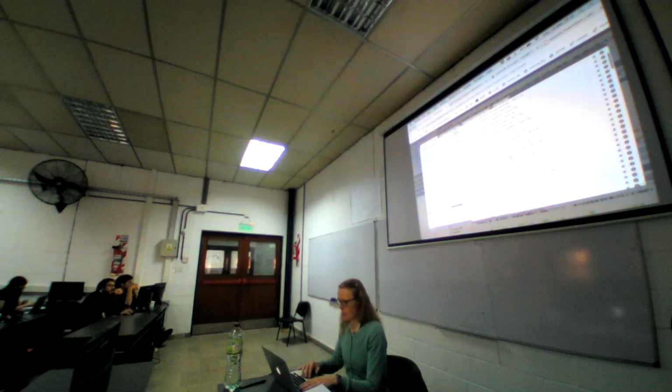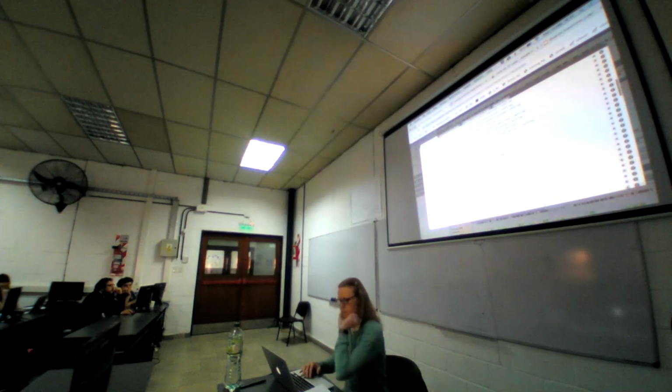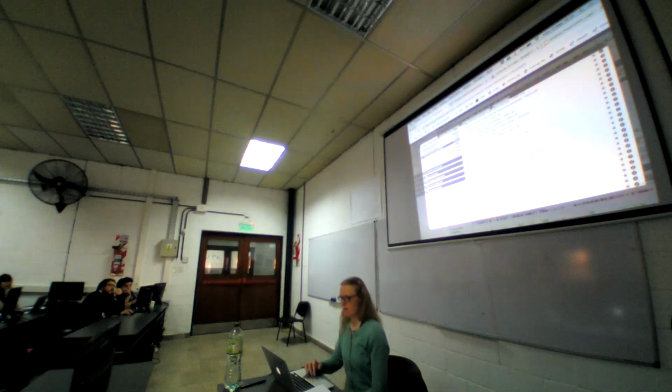I will add chicken and chimpanzee and mouse. Okay, so this is our pairwise alignments.